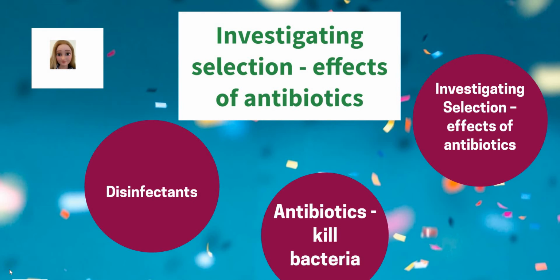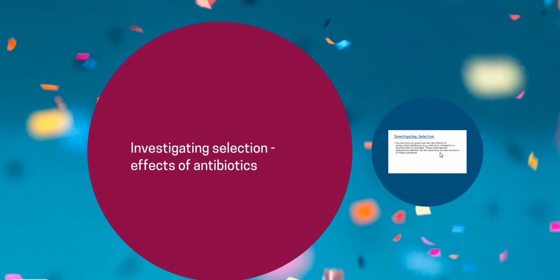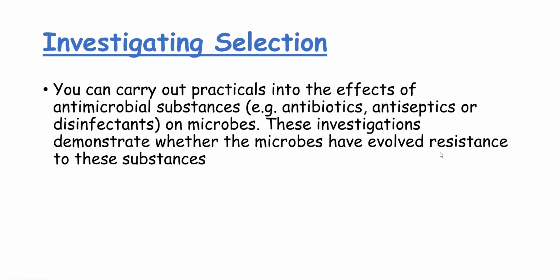Investigating selection, effects of antibiotics. So you can carry out practicals into the effect of antimicrobial substances like antibiotics, antiseptics or disinfectants on microbes. And these investigations demonstrate whether the microbes have evolved resistance to these substances.